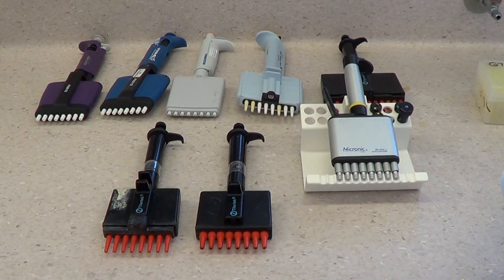Setting the volume of multi-channel pipettes. UWA teaching laboratories have a range of multi-channel pipettes.